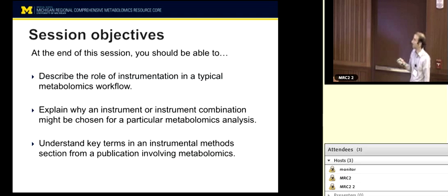And you could put a small asterisk in there and add CEMS, capillary electrophoresis. Some people like to do that for metabolomics. You could put in mass spec alone. Sometimes there are certain assays which can be done with a mass spec without a chromatography. You could put in, maybe under some circumstances, chromatography alone with an alternate detector. But by and large, most metabolomics is done on one of those three platforms.